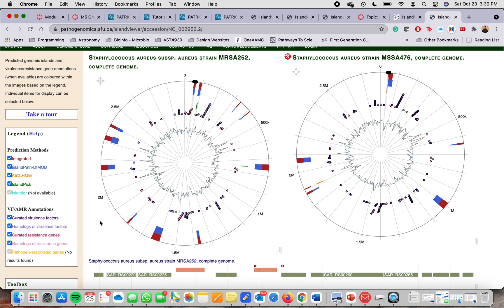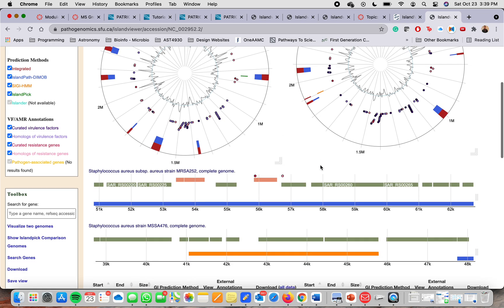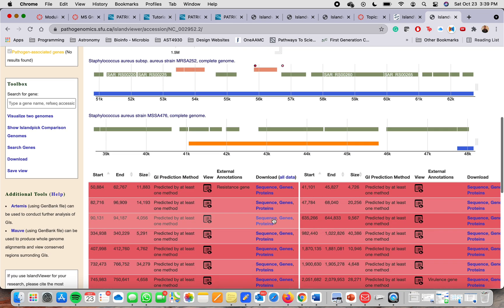And you can see here all the genes and even description of their function. You can get the sequence, genes, proteins.